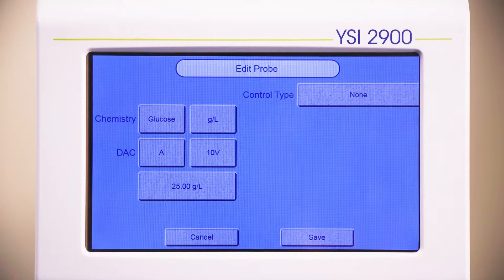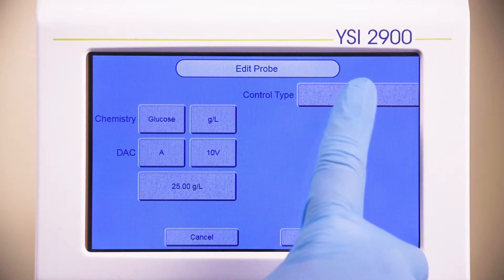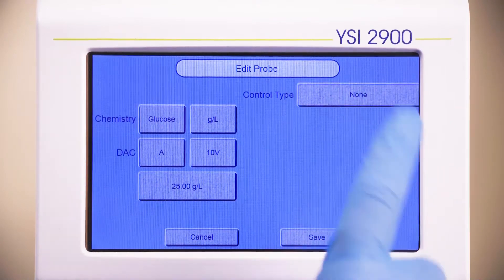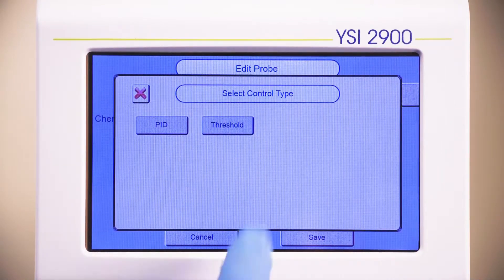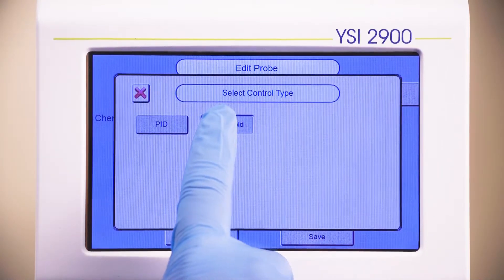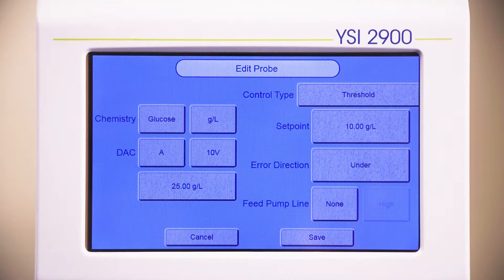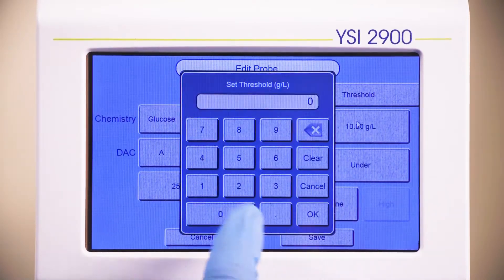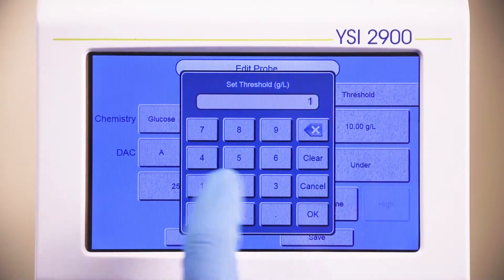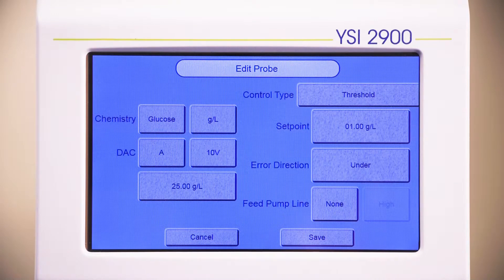If you are controlling the bioreactor run, press the button next to the control type and select PID or Threshold. The simplest control method is Threshold. This method is typically used to trigger an alarm. If you select Threshold, select a set point for the concentration at which you would like the instrument to send a signal. Select the limit for the alarm.